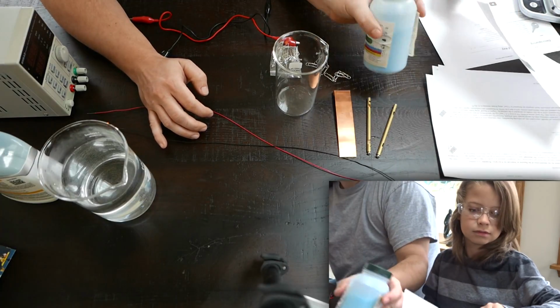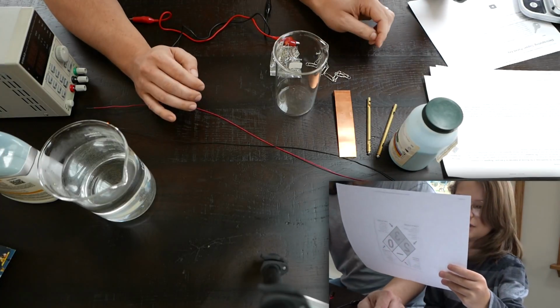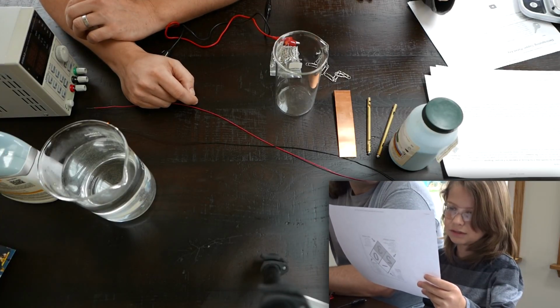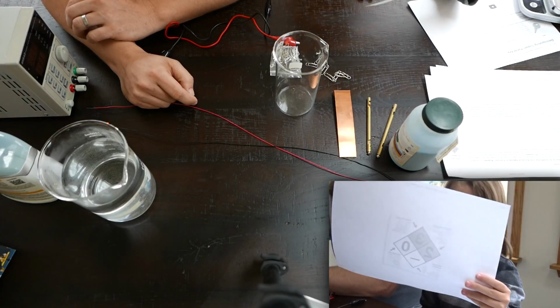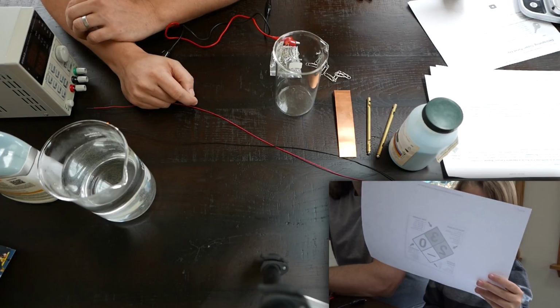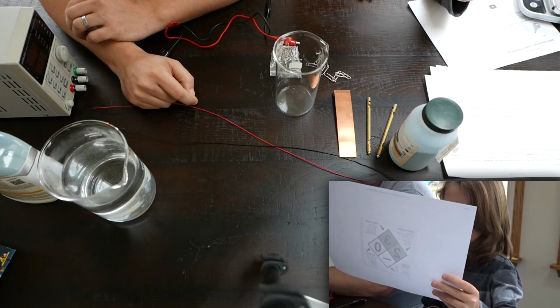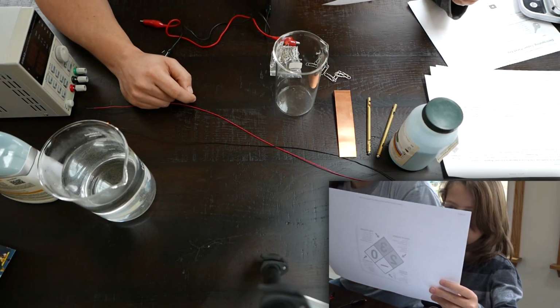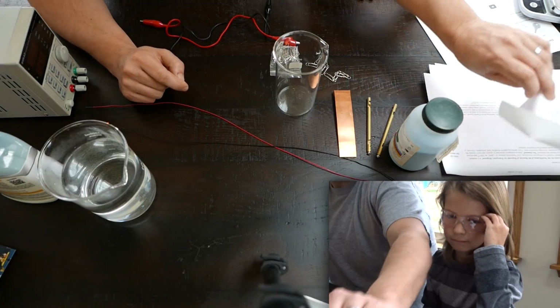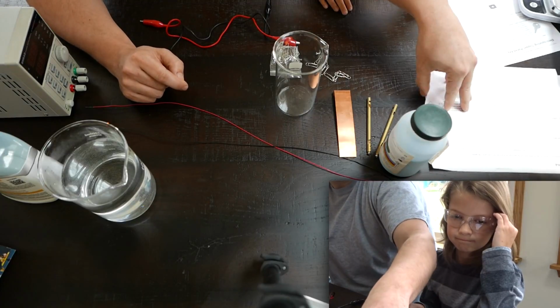Yeah, so these are stripes, and they're usually referred to as health hazard: deadly, extreme danger, hazardous, slightly hazardous. Wait, it says 2. It's hazardous. And then there's a 0. Instability, stable. Okay, so this is just what they typically look like, as a diamond shape. I did print out some. It's referred to as a fire diamond, which ours does not have.